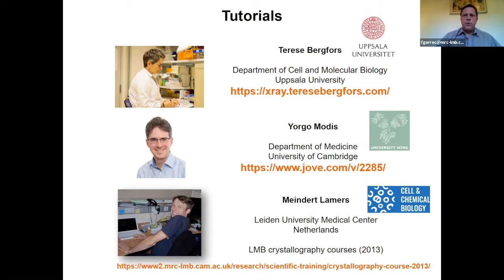I would also advise you to see a publication of Yorgo, who is from the university here, that he made a few years ago. It's a very interesting starting point with a video showing the characteristics and the setup of vapor diffusion and all the techniques for crystallization. And we have on the LMB crystallography courses page from 2013.